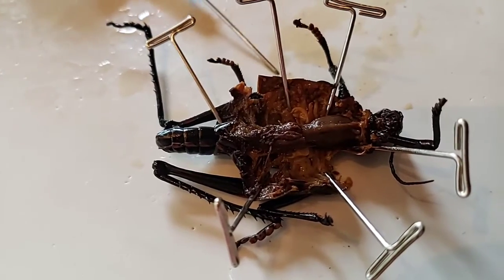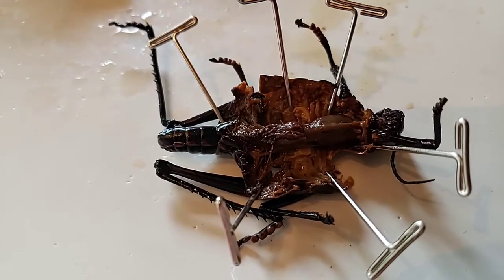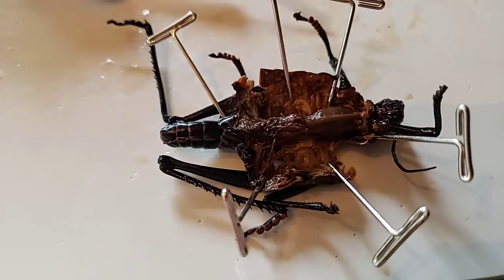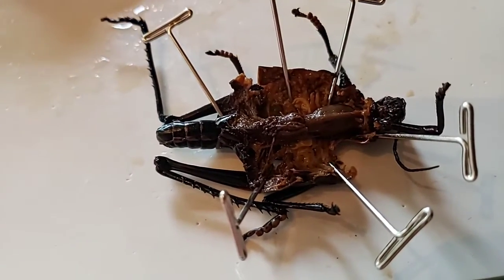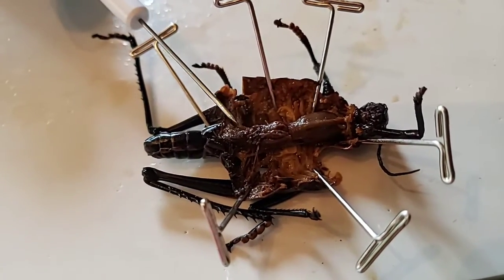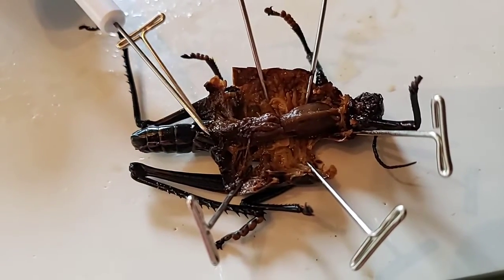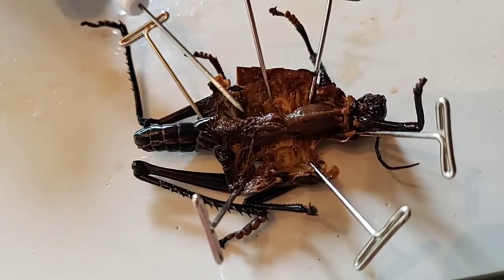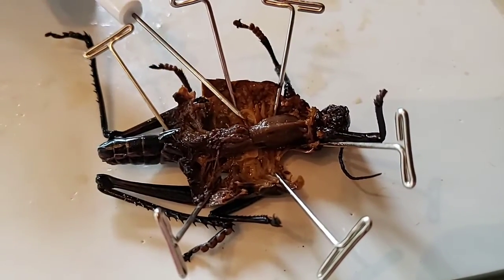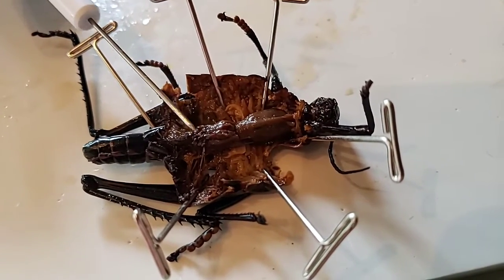So, next, you have the digestive tract. The crop is found at the anterior portion of the digestive tract. It stores food. After that, you're going to have the gastric caeca, or digestive glands that are attached to the stomach. So, Tanley, can you point right below the crop? I think it's all right in there. Yep.